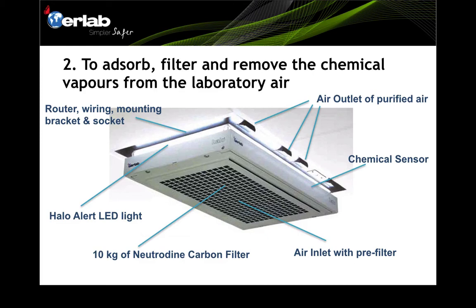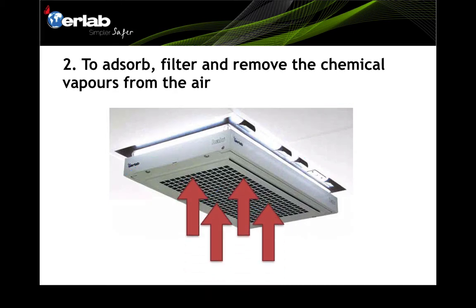The unit also features Harlow alert LED lights. When room air quality is acceptable, the LED light stays constant. Once fugitive emissions are detected, the LED light starts to blink to alert the user. Above the ceiling there are routers, wiring, mounting brackets, and sockets. The air is sucked into the Harlow system, filtered, and purified air is released back into the room — achieving four air changes per hour.